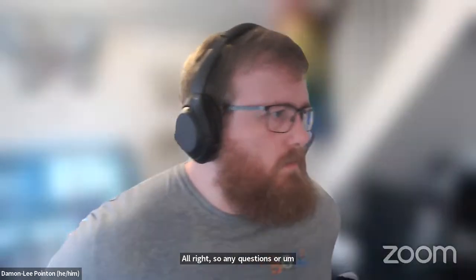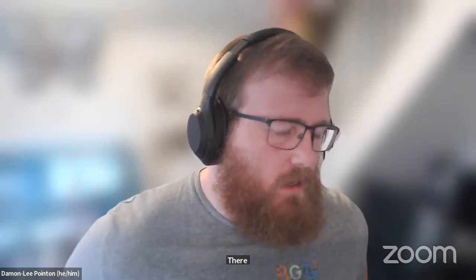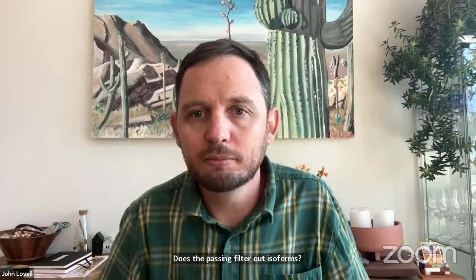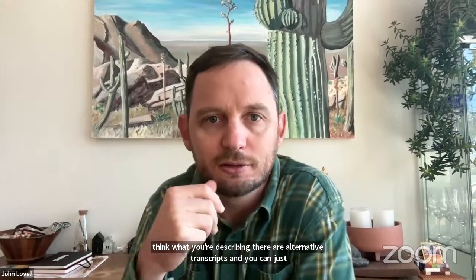Right, at the minute there are a couple of questions in the Discord, actually. Does the parsing filter out isoforms? I'm just opening up the Discord channel right now, it's going to take a second. You can also just ask with your face instead of fingers on Discord, but I'm fine to answer the Discord questions as well. So isoforms, I think what you're describing there are alternative transcripts for the same position.